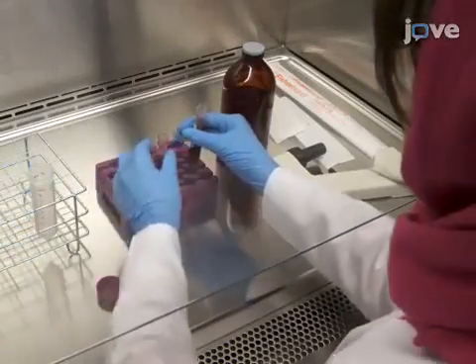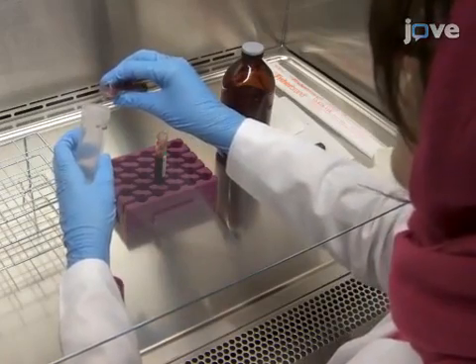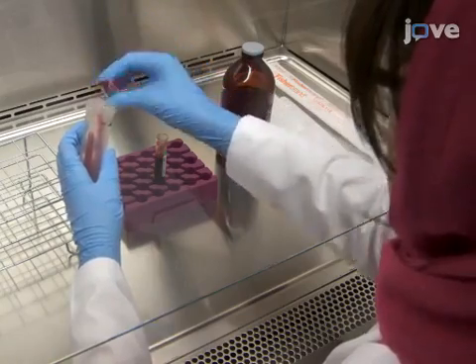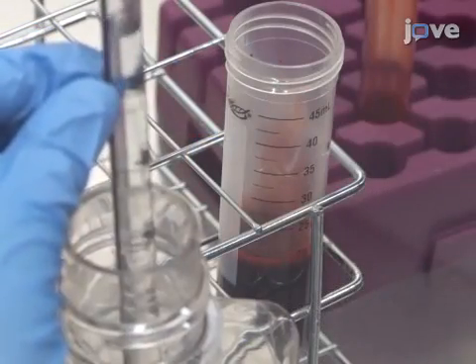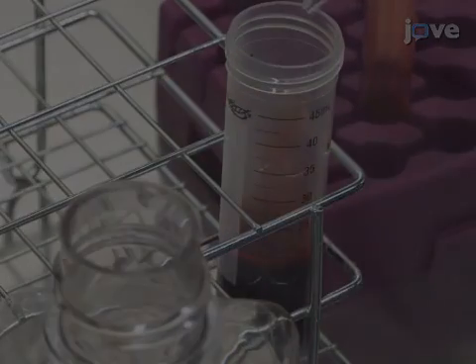To begin this procedure, in a biosafety cabinet, carefully transfer 10 to 15 milliliters of whole blood from the heparinized blood collection tube into a 50 milliliter sterile conical tube. Next, dilute the blood in PBS 1X at pH 7.4 at a ratio of 1 to 1.